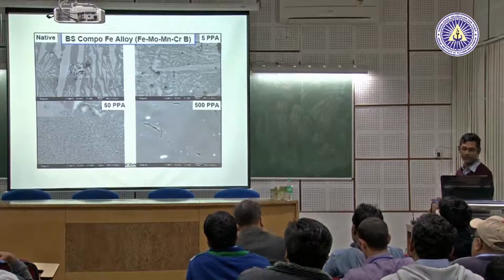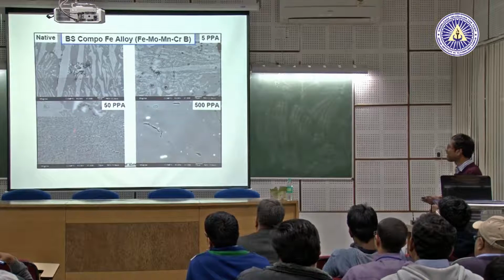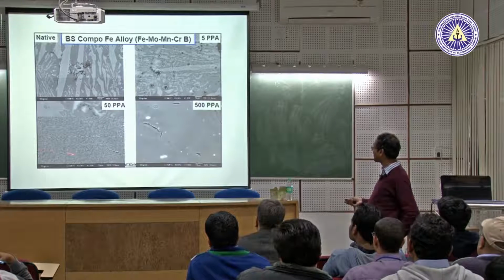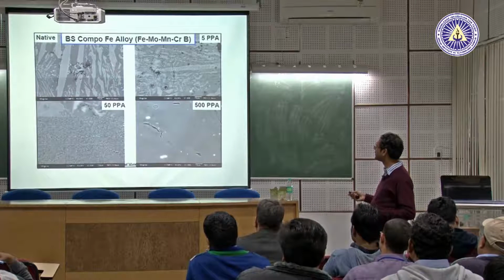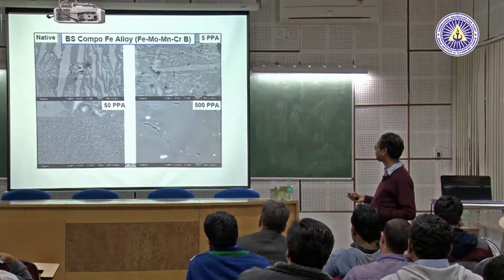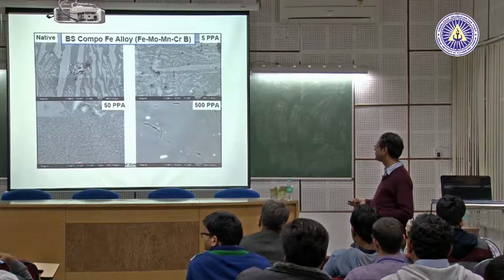this is also important here. This is different levels of coating. Sometimes your sample will look like this also, image. Why? Because it has scanned, but this area could not be properly scanned because of the charging problem. This is actually a backscattered image. You can see different phases here, white and grey and black are present. Here you don't see anything, here something is there but not clear.